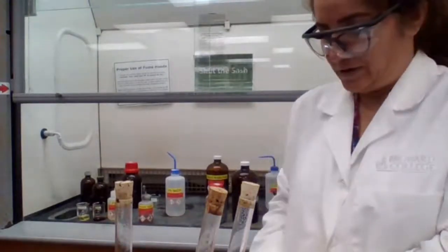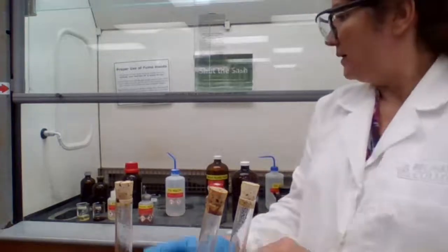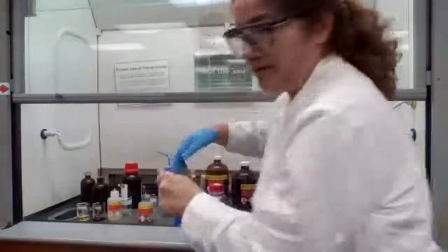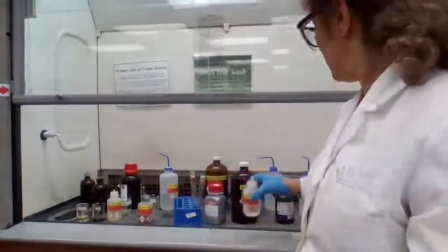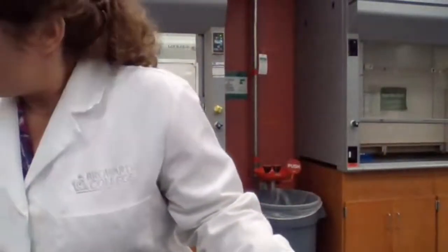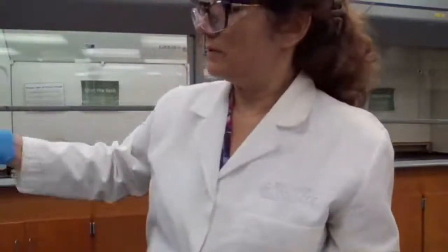It is tertiary, yes. That's a good thing. At least it's working. So we know that if we have primary, secondary, or tertiary, how can we distinguish? I promised I will show you the, okay, it did dissolve.